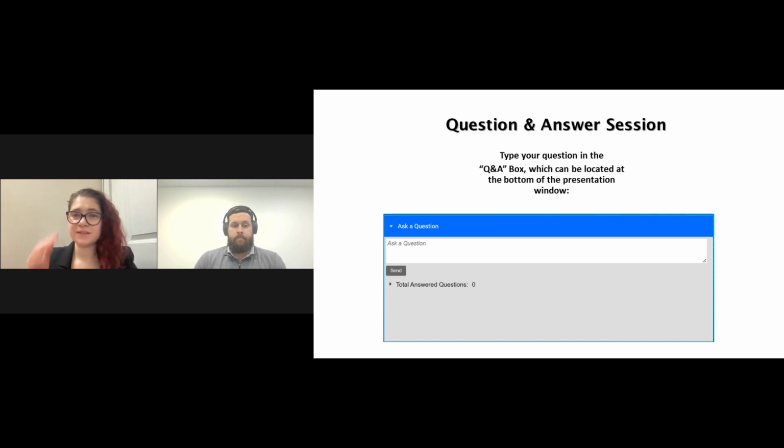Great, thank you. The next question here says, can you put a PID in series with an ECD on this 2050 GC, as I have on my 2010 Plus GC? Yes. So in regards to this, the answer is not yet. This is something that we're currently working on. I would expect us to have a solution for this later this year or early next year. We don't have a current solution yet, but it should be made available in the future.